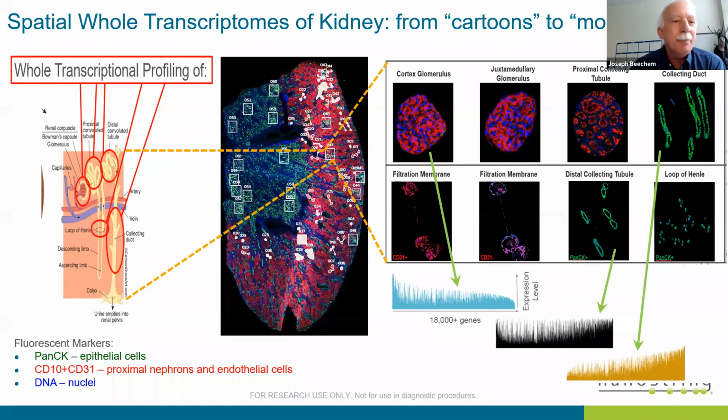So here is schematically, now with some real data, the little cartoon on the left. Here is the full-blown kidney: the red is the cortical area, and the green is the medullary region. I'm going to go into one little business unit, one area around the glomerulus. You can see that blown up there. There's a couple of million of those in a typical human organ, to give you an idea how many of those little business units are in there functioning.